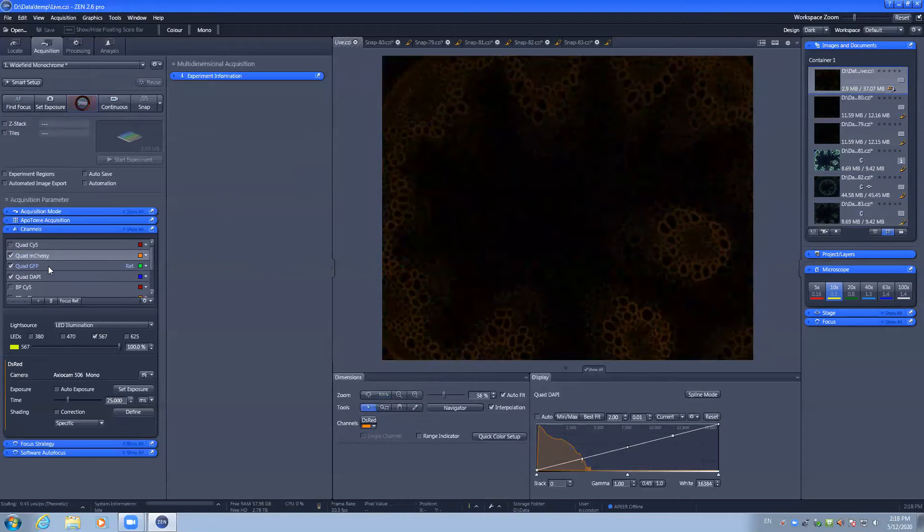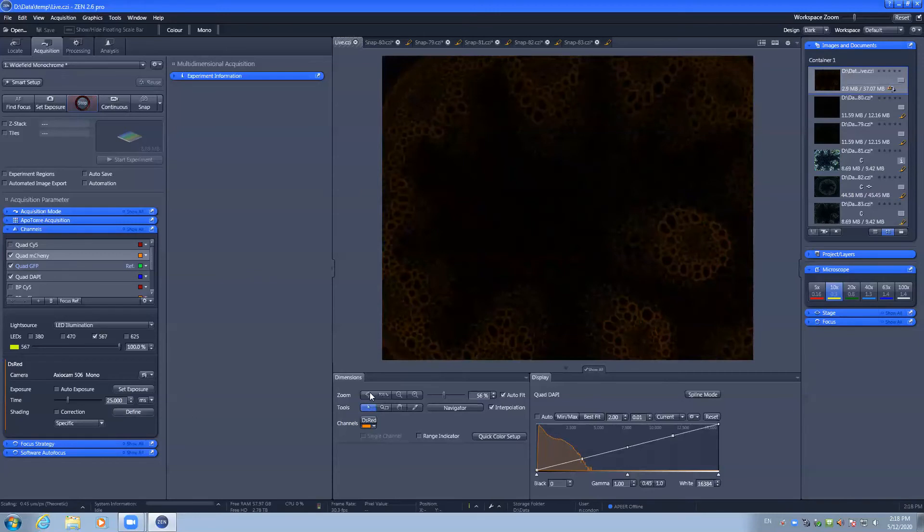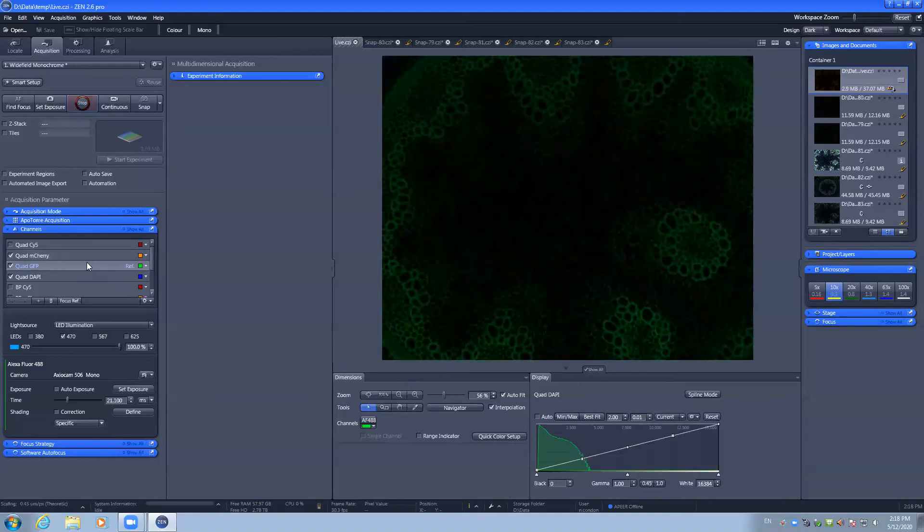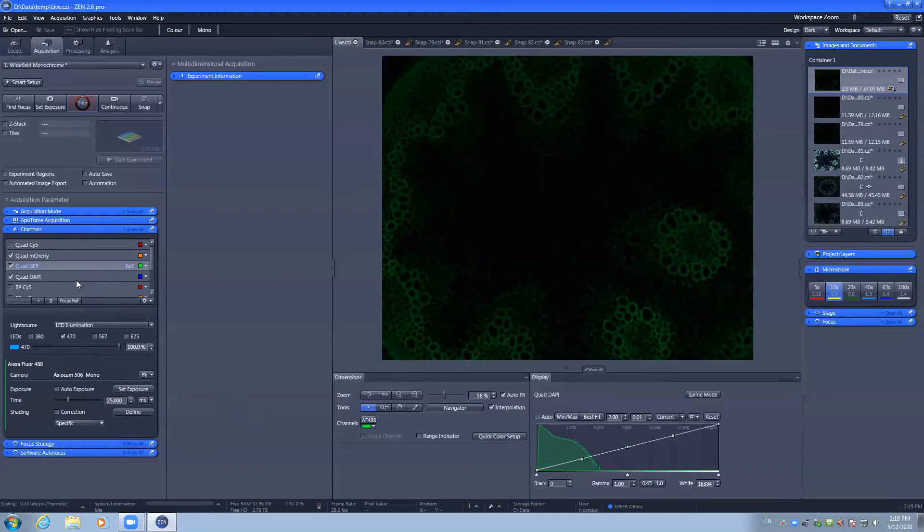Working from the mCherry channel, we can see that it has a 25 millisecond exposure time and we have good dynamic range. For GFP, we have a 21.1 millisecond exposure time which we can tidy up to have a 25 millisecond exposure time.